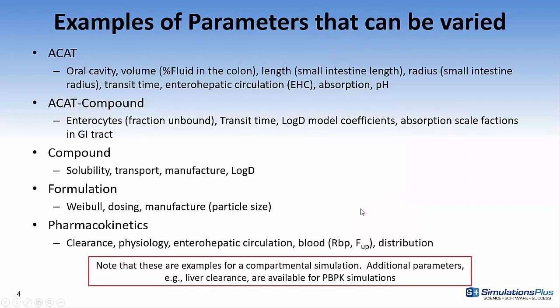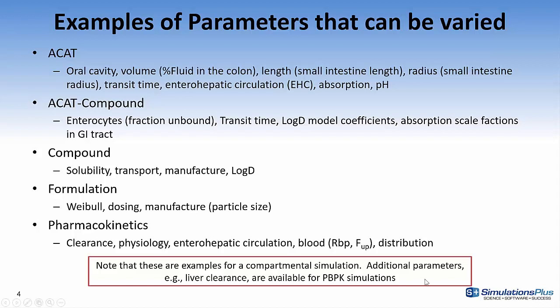These are a few examples of parameters that can be varied. Note that this is set up for a compartmental simulation. If you have a PBPK simulation, you'll have additional parameters, for example, liver clearance that can be modified.